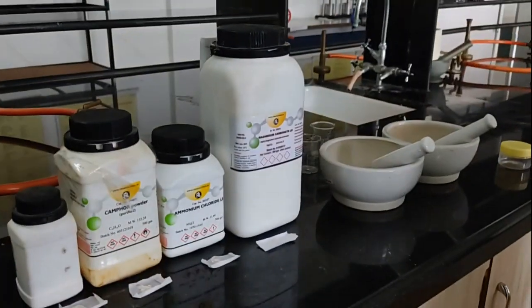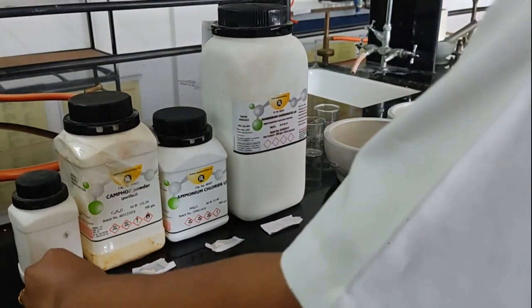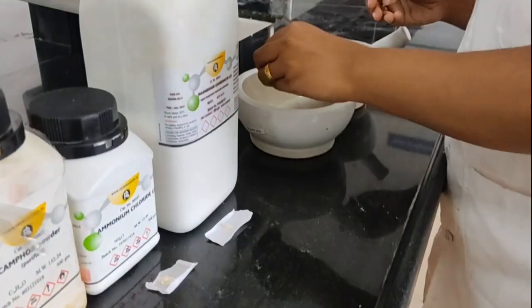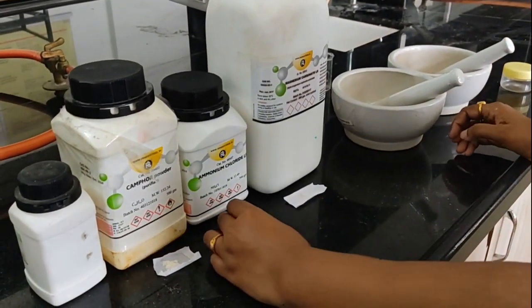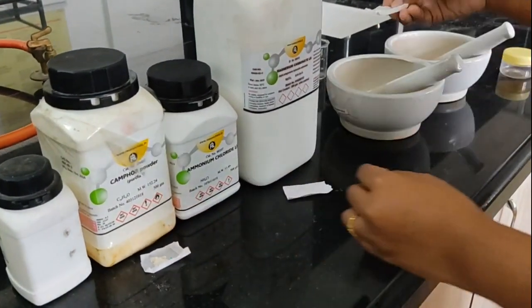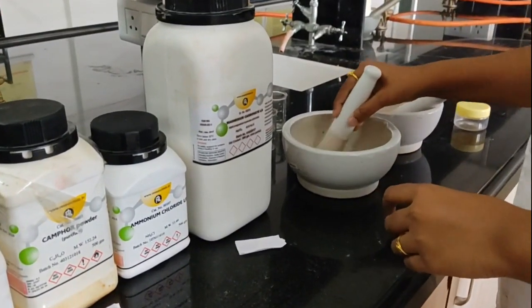So first of all, I am going to transfer the menthol into this first mortar, and again going to add this ammonium chloride into it and mix it properly in this first mortar.